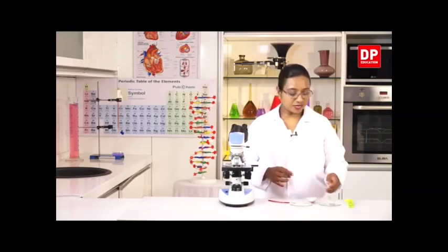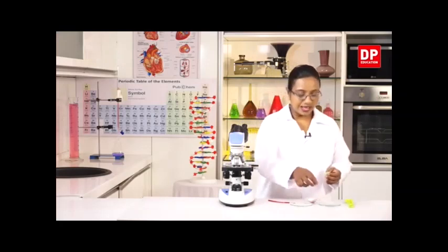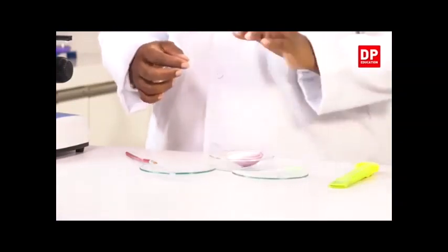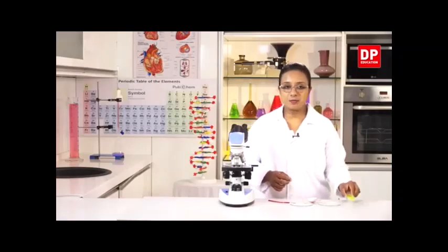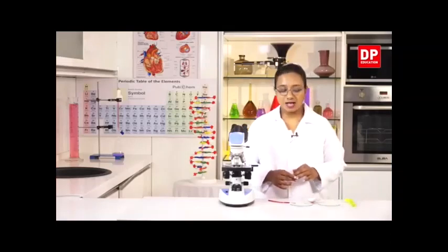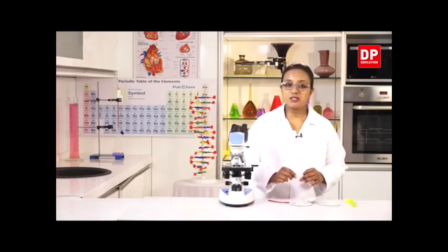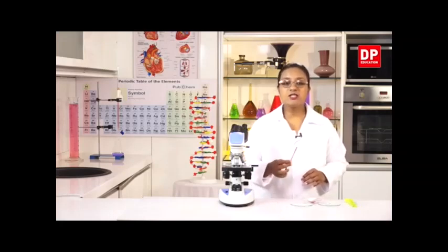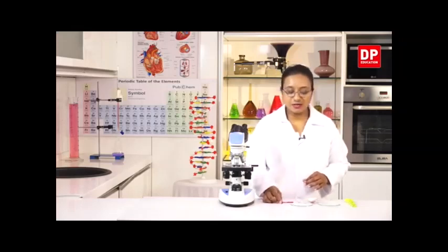As you know already, to prepare a temporary slide, we will need a clean glass slide and a cover slip. And also, to cut and take out very thin onion peels, I will need a sharp blade, an onion as the sample or the specimen, and also to initially transfer the small cut out onion peels into water, I have a watch glass with water in it. To transfer the specimen from water onto the glass slide, I'll be using the brush.